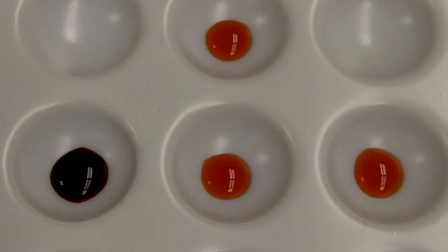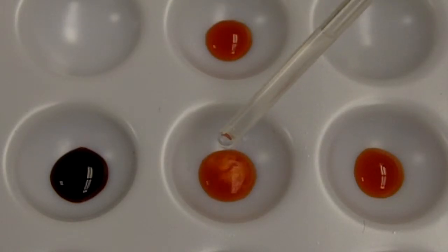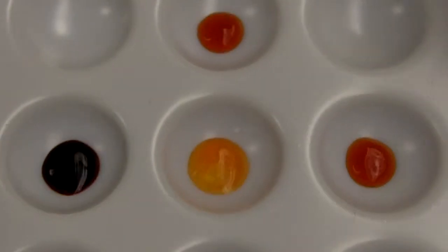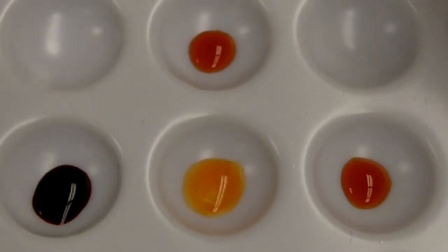In well number 2, before adding the iron as the procedure describes, I'm going to add this substance here, which will make the change that iron gives a little bit more obvious. So this resulted in a shift as well, and we can see a yellowish color resulting from the addition of that substance, oxalic acid.